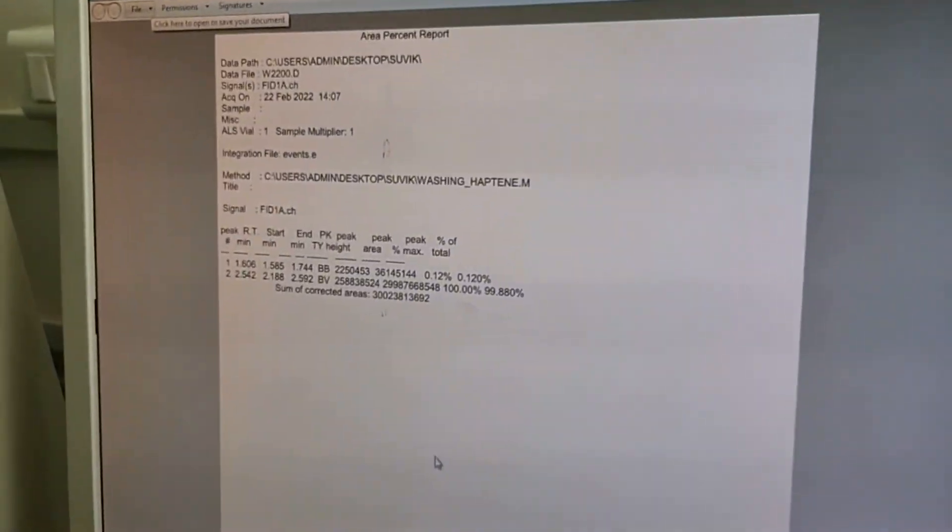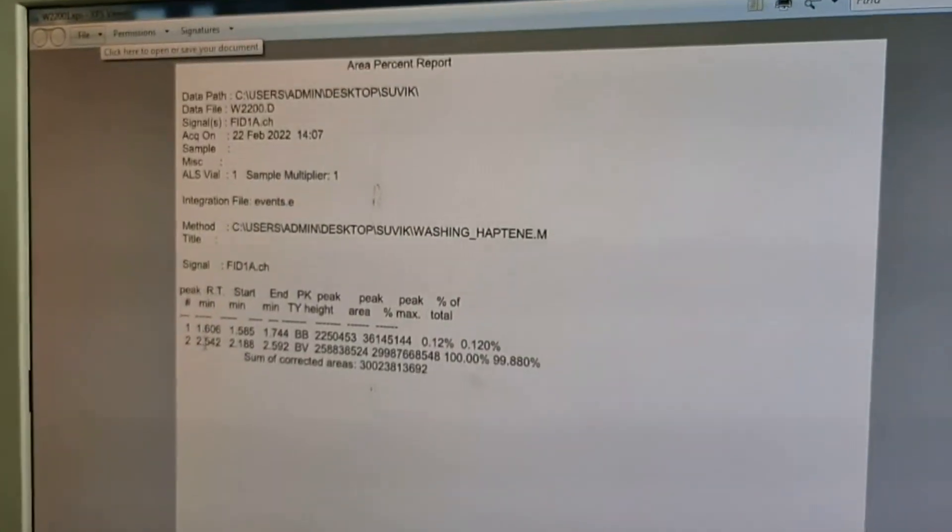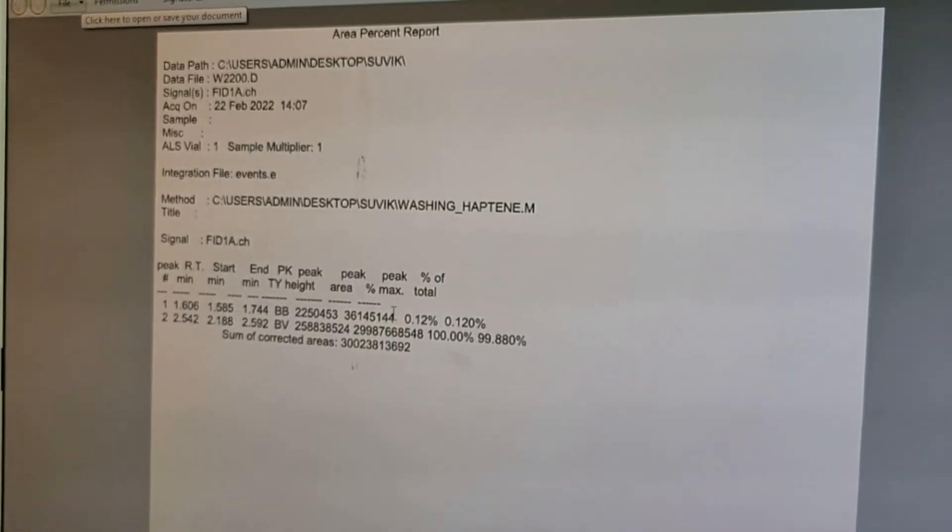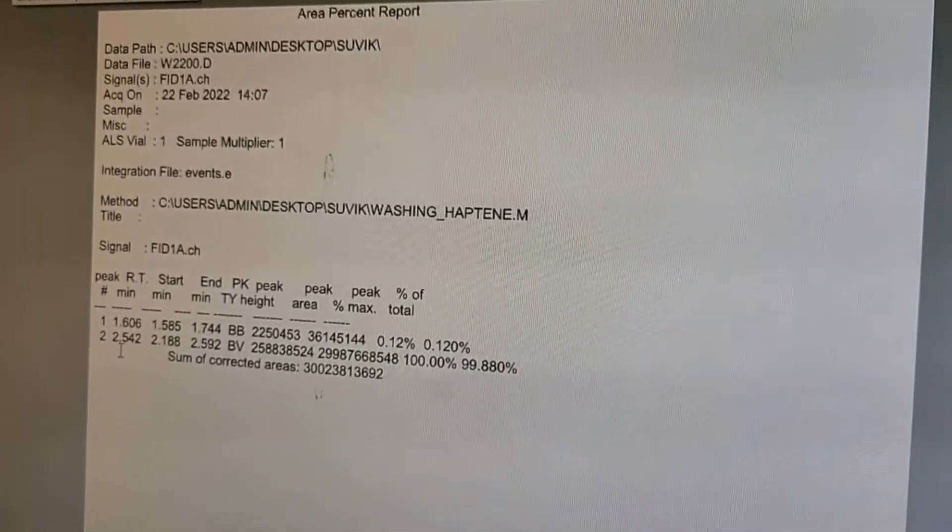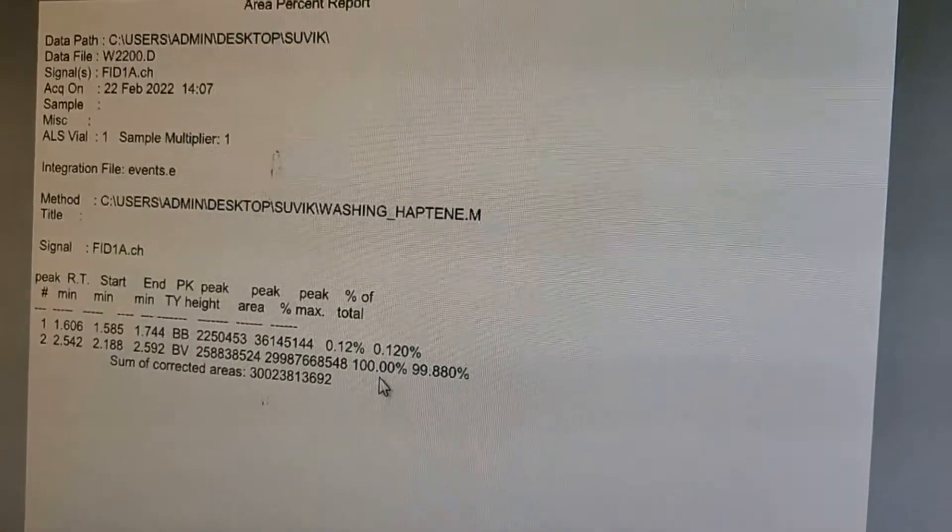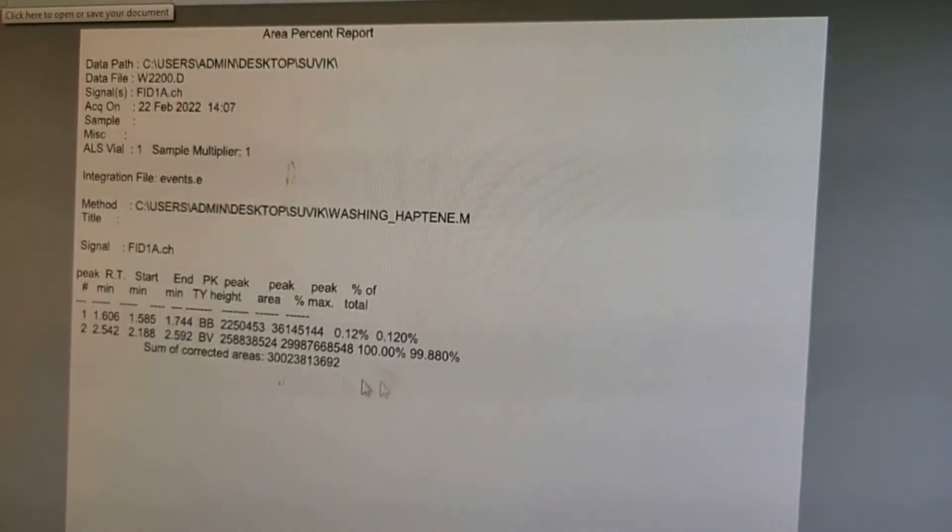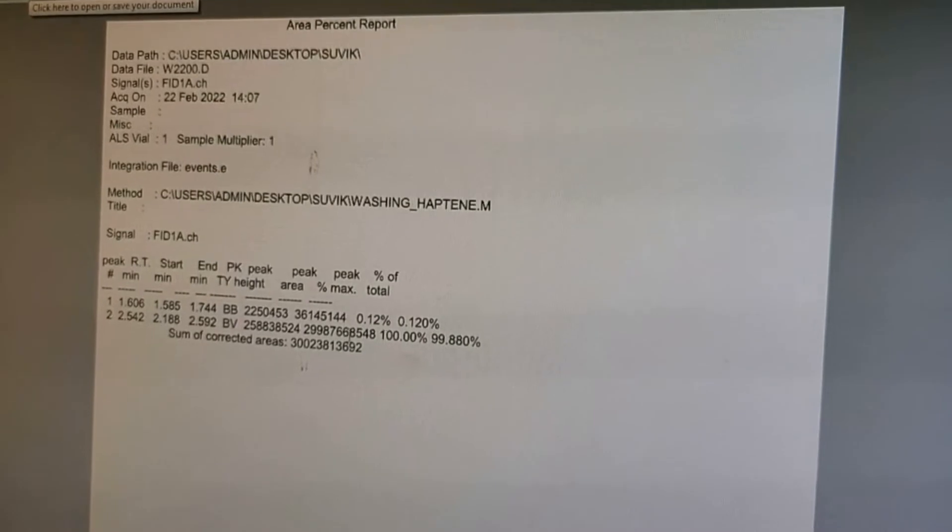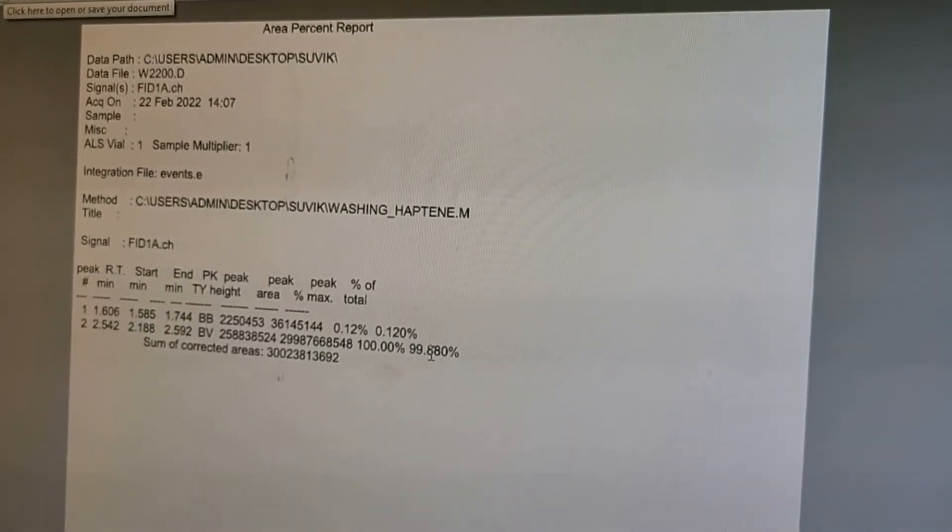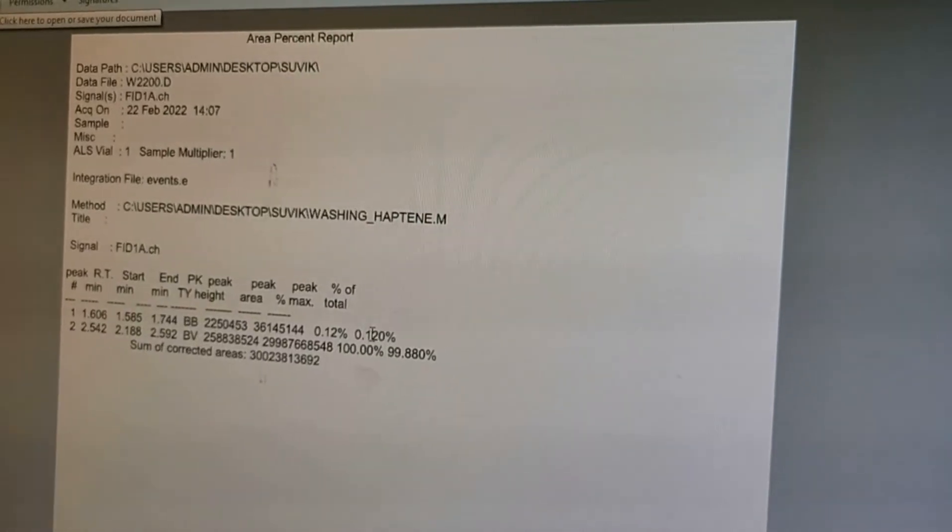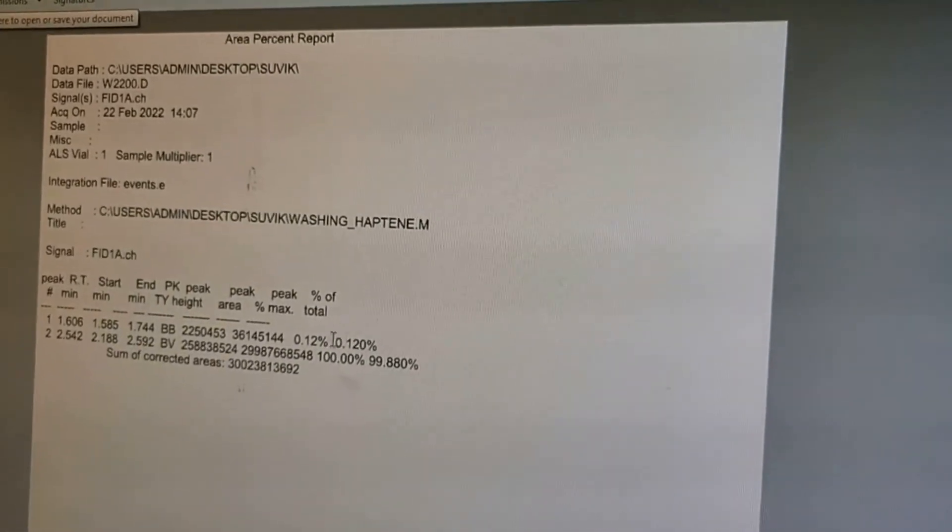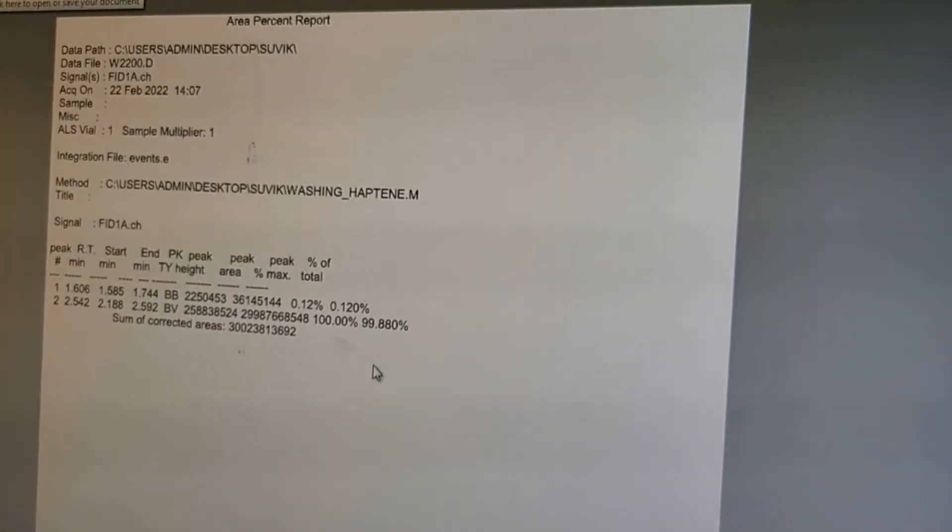Now our result is generated. Now you can see here we detect the 2 peaks. One at the retention time 1.606 and one is 2.542. The 100 percent our sample is methanol. So you can see here methanol peak is giving 99.8880, is the pure form we get it, and the other some traces are detected.